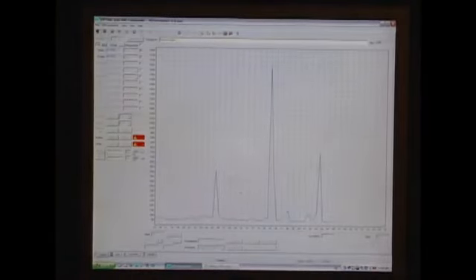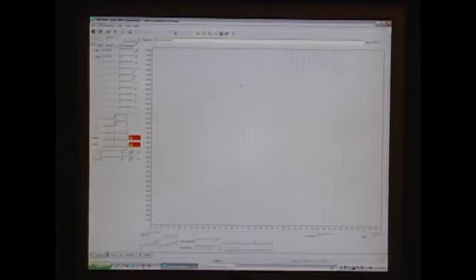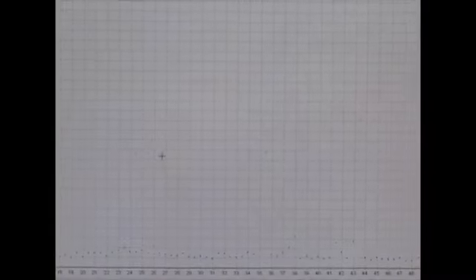This right now is just drawing lines. If I right click in here and select dots, I can actually see the data points. And hopefully you can see right away that this would not be something that would be recognized in analysis software. There's only one data point here. And you really want a minimum of at least 3 on its way up and on its way down. So that click indicates that it's finished.